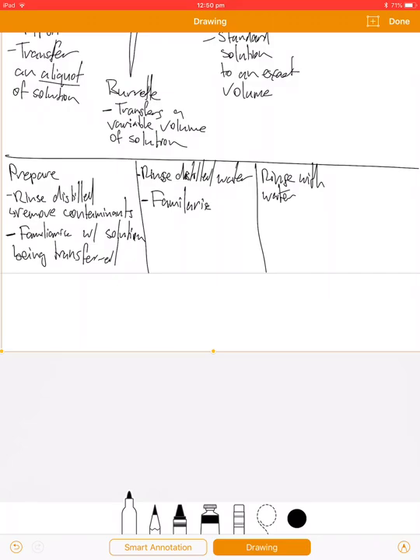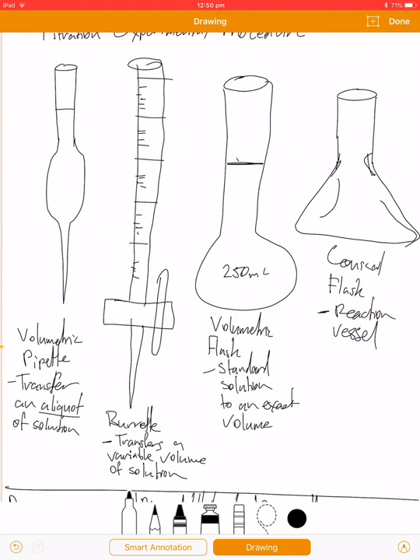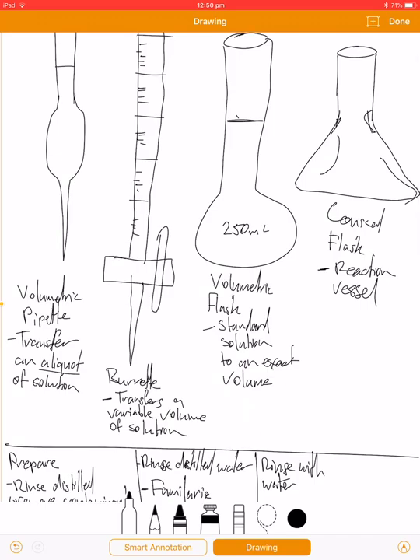Reason why, we're not going to familiarize it with anything, because if we familiarize our volumetric flask, you're putting in little bits of residue of a solution in there, and that's going to put moles in there to start with, which is going to change our concentration. If anything, it's going to increase our concentration, or it could be the wrong solution, therefore that'll react and whatever that does. If there's residue water in there, does it matter? No, because this is being made up to the mark with water anyway, and obviously that's going to be with a nice meniscus. So if there's already little bits of water kicking around on the edges here, it doesn't matter because it's being made up with water anyway.